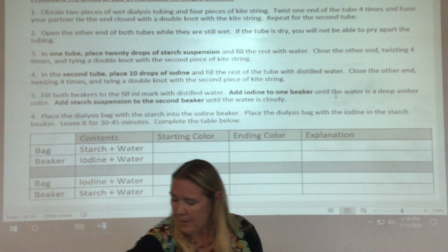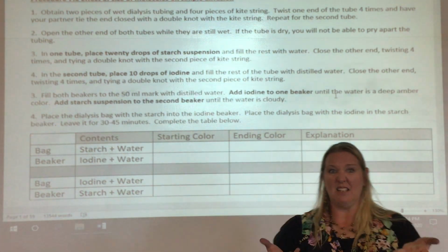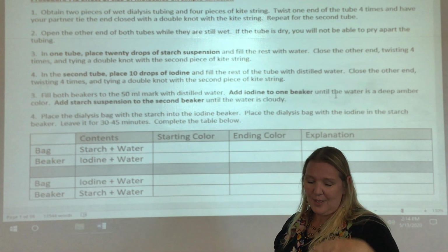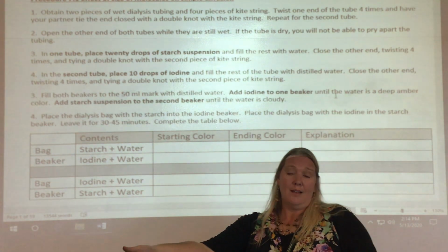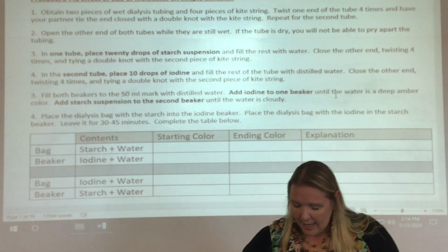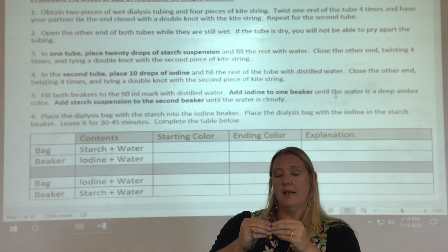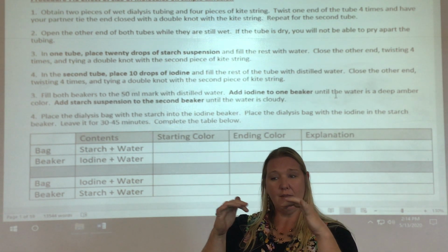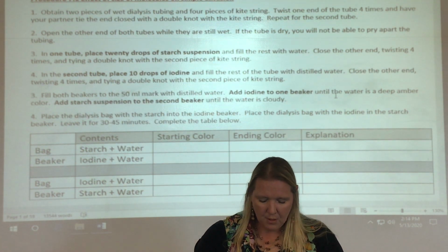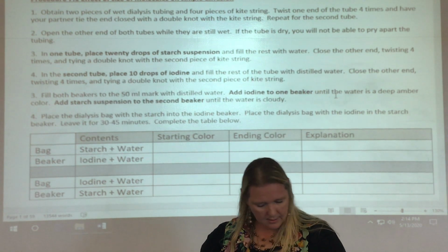Okay? And so what we have, and I have a before and after. This is one of those experiments that has to sit for like 30 or 45 minutes, but we're not going to stand here and look at each other in the video. So I have already performed the experiment, and then we'll show the results in just a second. Okay? So what we did is we got some dialysis tubing. It's just a plastic tubing, and it has very small microscopic pores or holes in it. And what we did is we put some water and some starch in one.